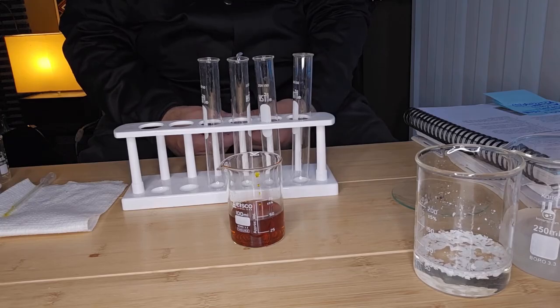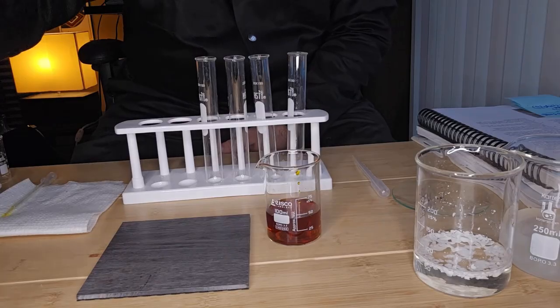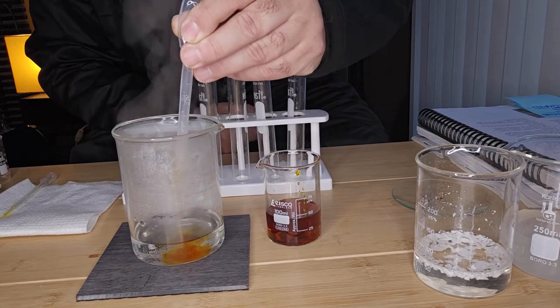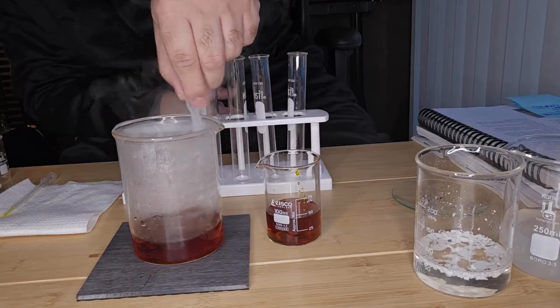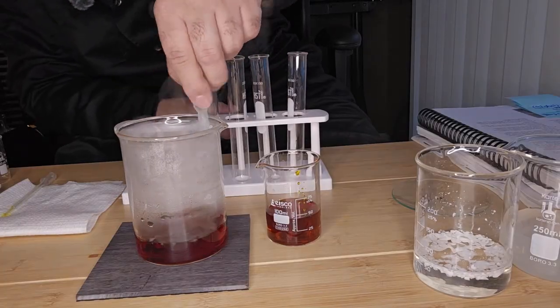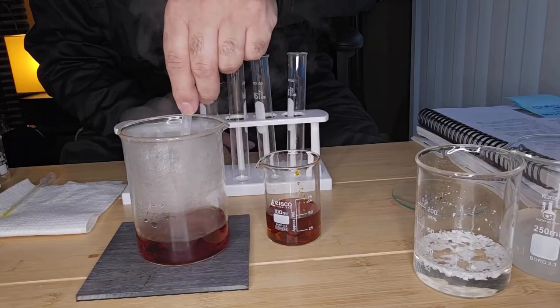Okay, my water is now boiling, so I'm going to add 1 mL of my iron chloride solution and mix it. And then I'm just going to let that cool down to proceed with the experiment.